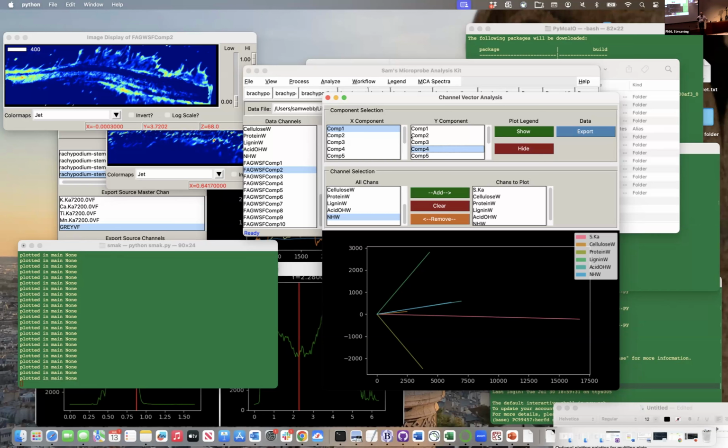Okay, this really plays into my question really nicely. Thank you for setting it up. So one of the things I'm looking at is that there's a lot of power behind being able to take something from the beamline and then analyze it maybe by SIMS, where you can get isotopic information, and overlay that. Now, besides obviously having something like fiducial marks to identify the locations, or being really careful about sample prep, there are other things that we need to think about, especially if we're trying to match those very different data sets. Are there tool suggestions or tips that might help make that process easier?